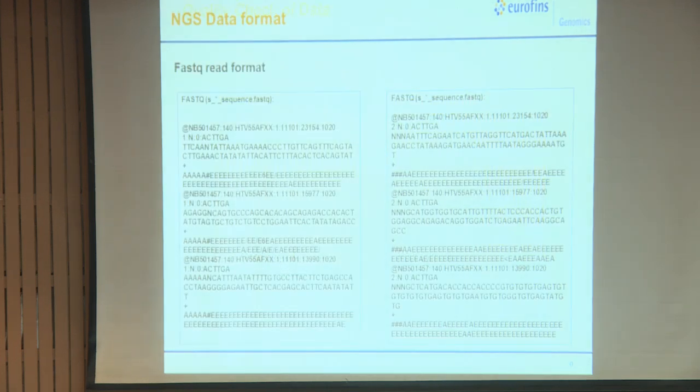What are the AAEE standing for in the quality? Ma'am, they are base quality ASCII scores. If you convert it, capital A will be 65, something like that. So, it is the ASCII score. You see the conversion in ASCII, so you can convert it. They are all values.